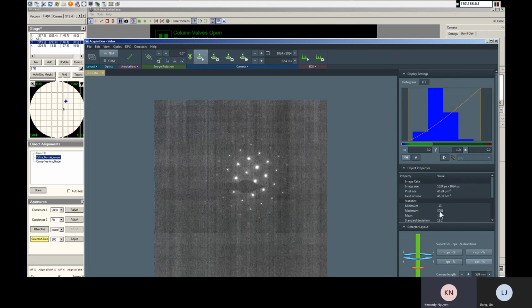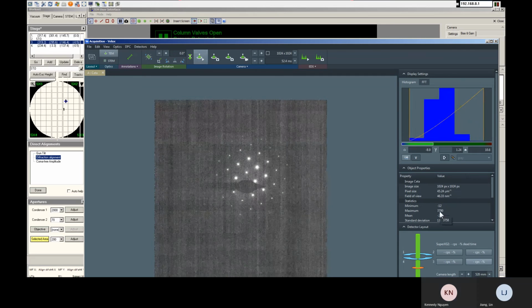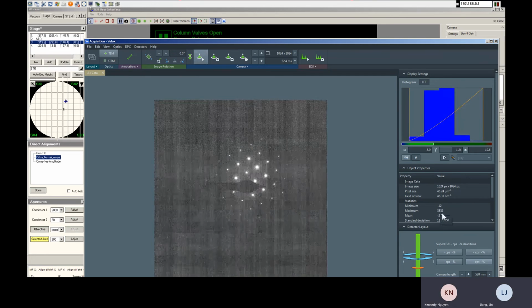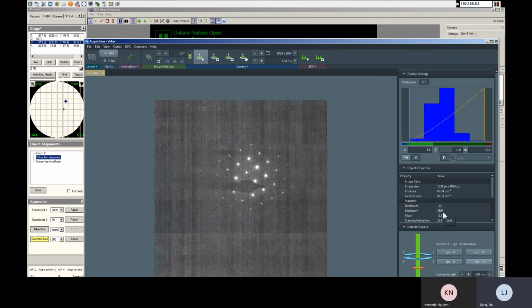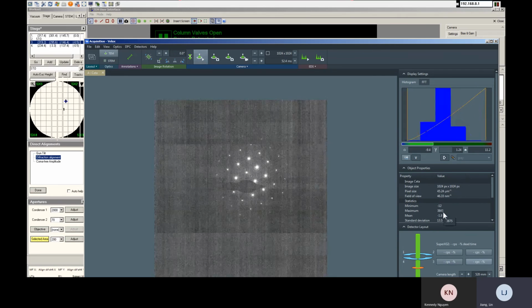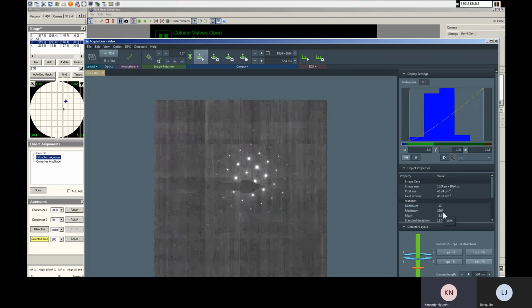So that's at 3,000, 4,000 or so. So there's two ways, right? You can either increase exposure time, or I can increase intensity. Which way do you recommend? I would increase the intensity.